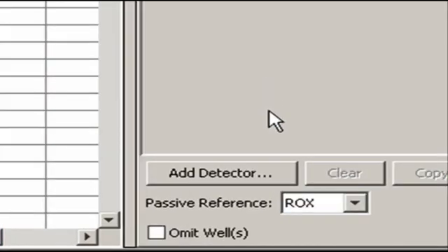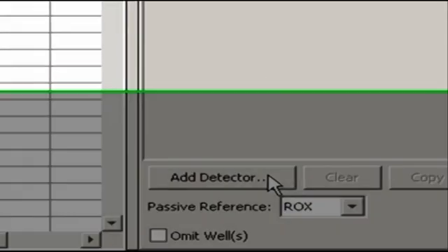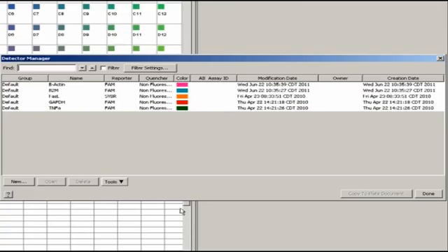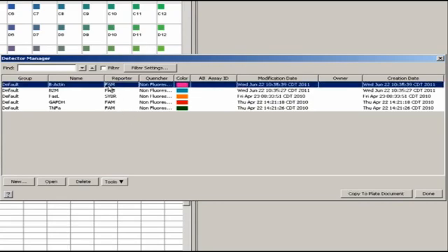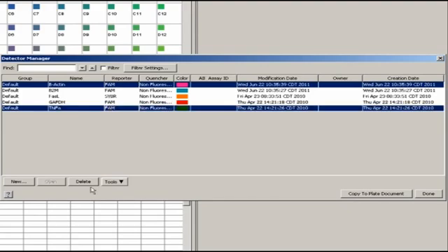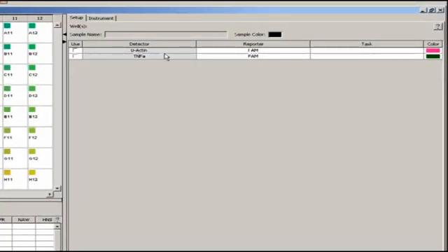We need to tell the software what assays are on the plate. To do so, click Add Detector. Now, I'll just highlight my control gene, Beta Actin, and using the control key, also select a target gene, TNF-alpha. I copy these to the plate document and click Done. And there they are.